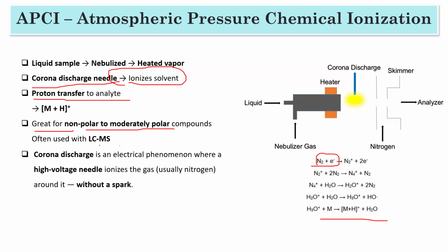And we can use different techniques like LCMS, GCMS. These days people use them because of separation before the mass spectrometer. If your sample is a mixture, it is good to separate the components first.